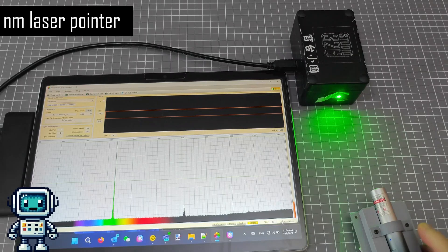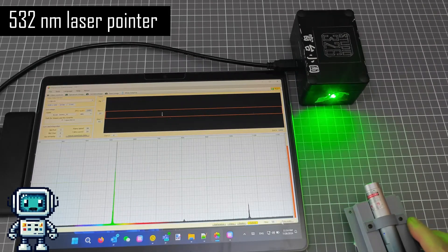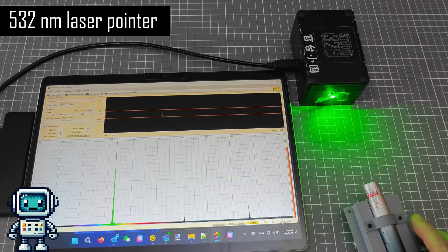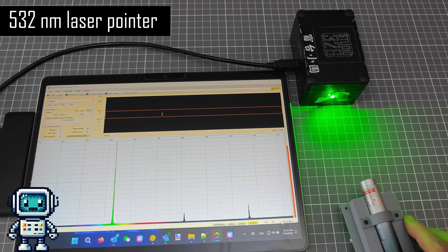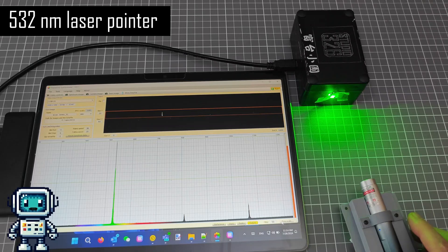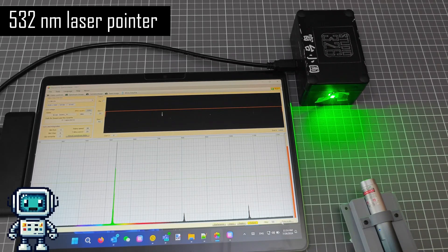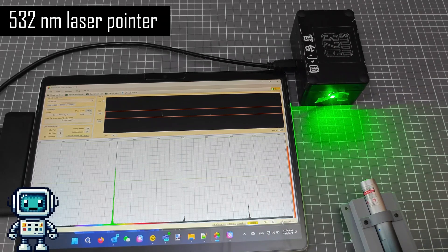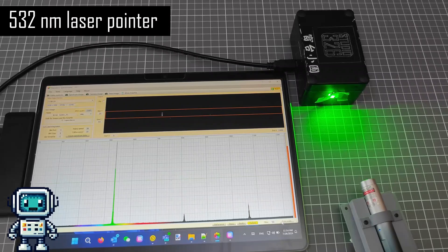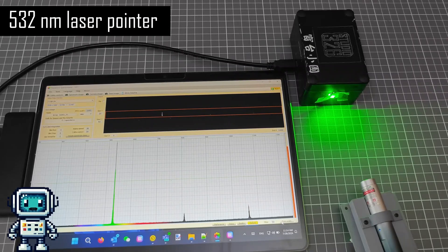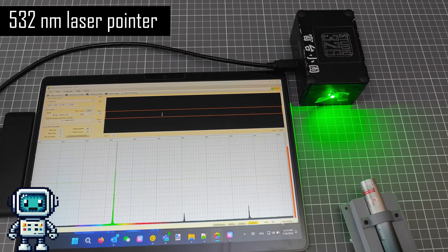On this green laser, you can see two infrared peaks, one at 808 and the other at 1064 nanometers. Well, there certainly is some energy at both these wavelengths within the laser itself, but the question is this: are these IR lines really being emitted by this cheap 532 nanometer laser pointer?